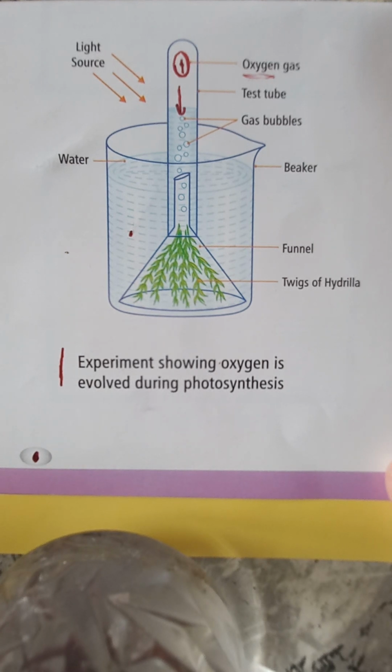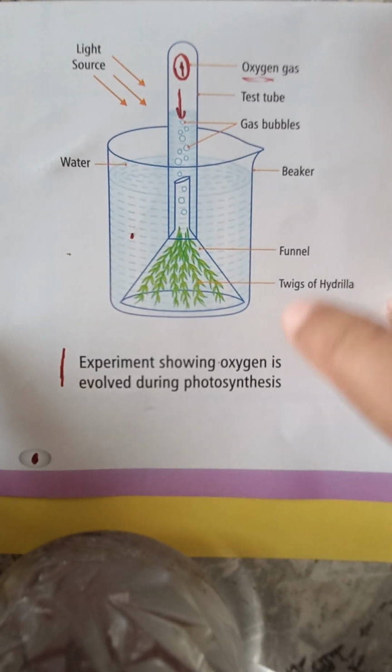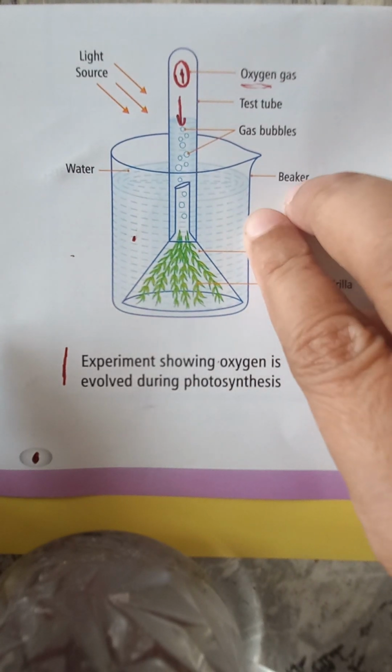Today we are going to discuss an experiment showing oxygen is evolved during photosynthesis. Now this is the aim of the experiment, that is to show oxygen is evolved during photosynthesis. Now notice the setup very carefully.